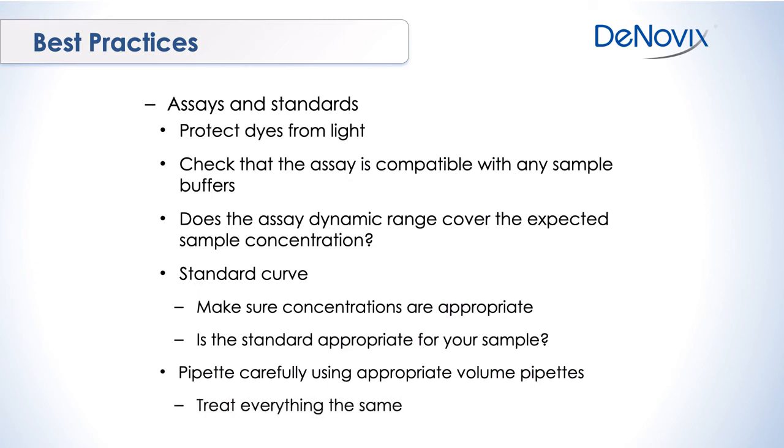And treat everything the same. Treat your samples and your standard as exactly the same. So prepare them at the same time, use the same reagents when you're preparing them. And just moving on, when we are measuring our samples, there's a few things to consider.